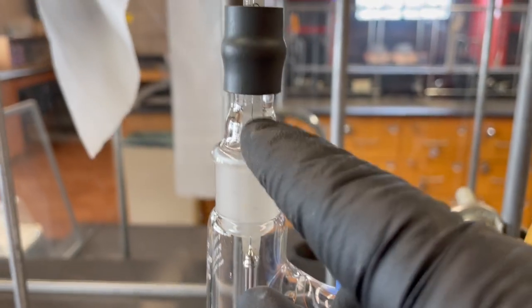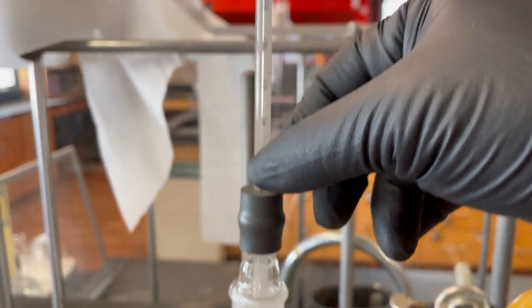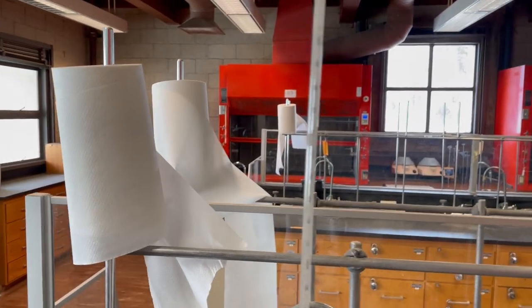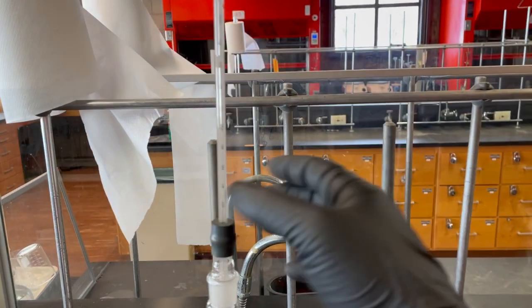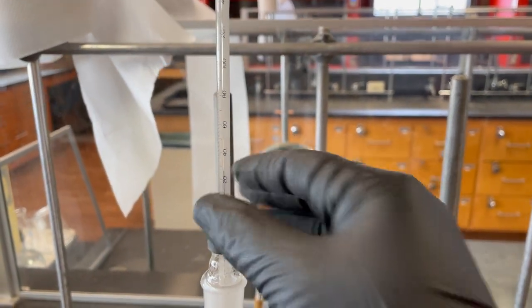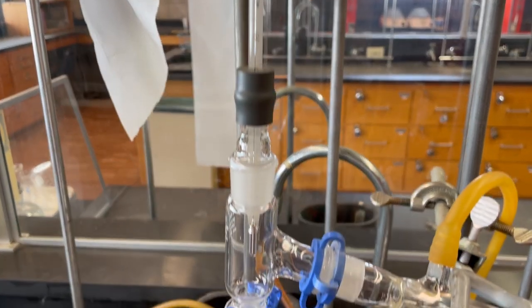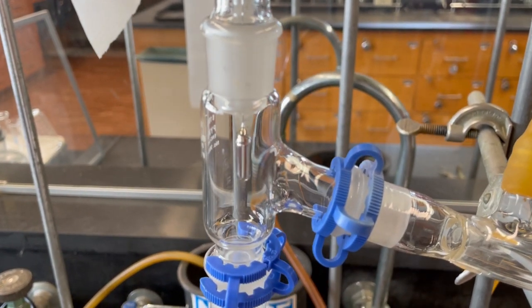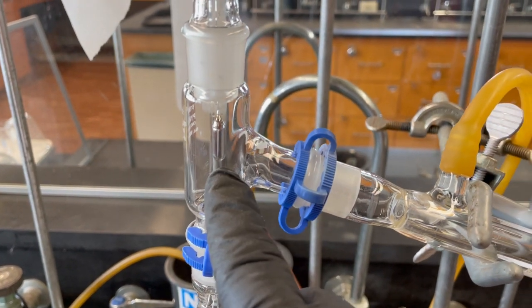That thermometer is stuck through the outlet adapter, and you want to make sure that you're super careful with that. You don't want to reach over and hit that and break it, because then that sucks and you gotta clean up. Depends on if you have a mercury thermometer or an alcohol thermometer. Could be a decent cleanup, or a terrible cleanup. But either way, be careful. You don't want to break stuff in lab, right?